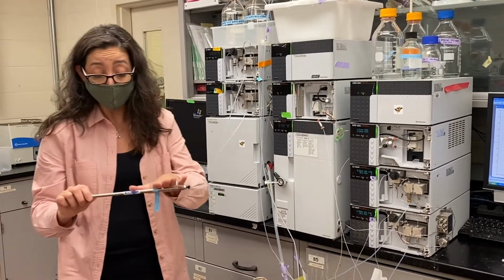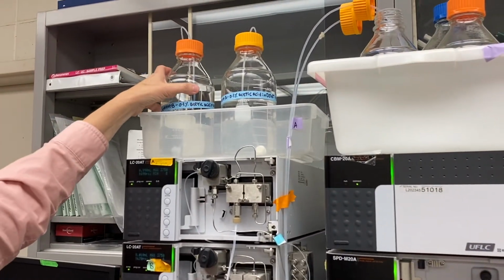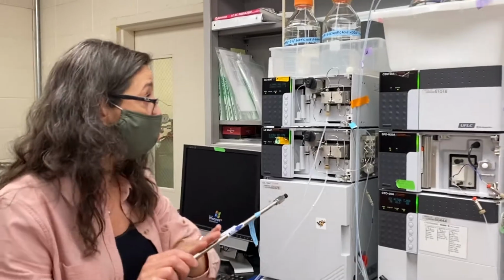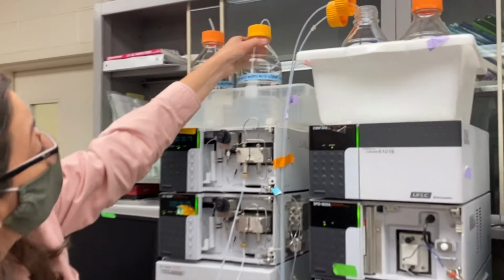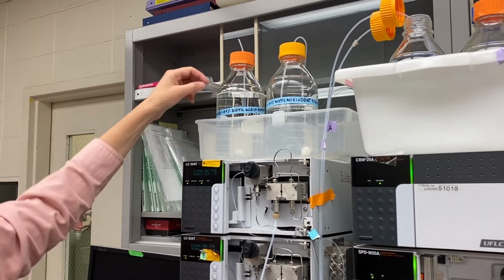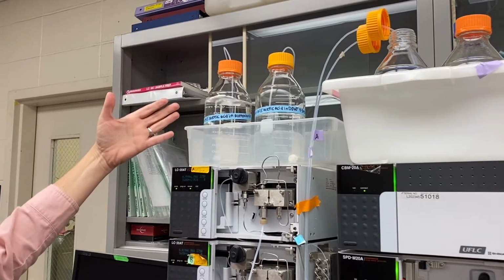So we have a hydrophobic stationary phase, and then we're going to be starting with a very polar solvent. We're going to be starting with 0.1% acetic acid solution, which is water with a little bit of acid, because that's the specification for the column, that you have a certain pH. So we start with water. Actually, this is water, 0.1% acetic acid in water is the solvent that we're starting with, with a very, very small concentration of solvent B, which is acetonitrile, also with acetic acid to get to the pH that is desired.